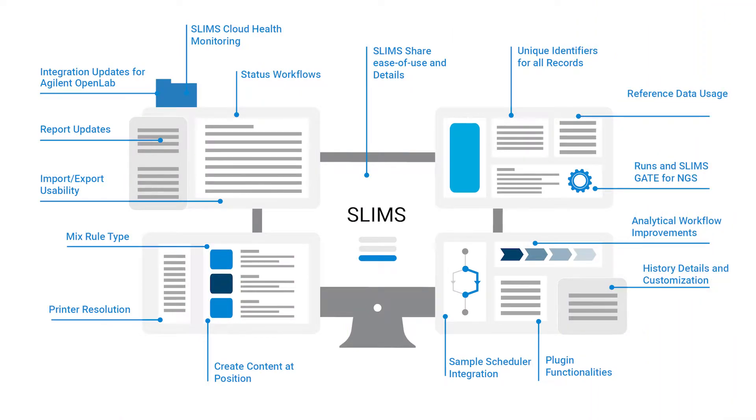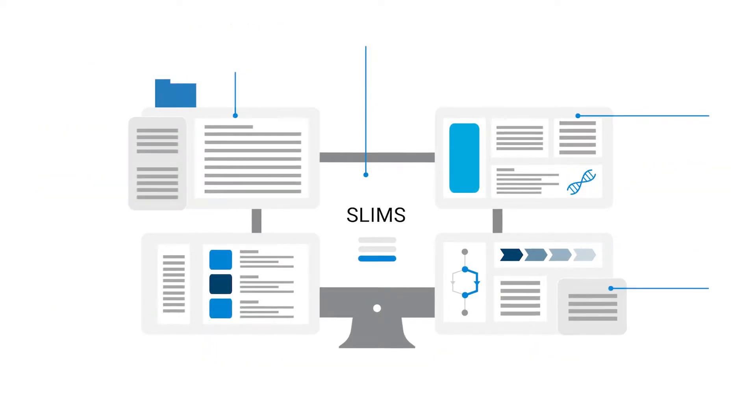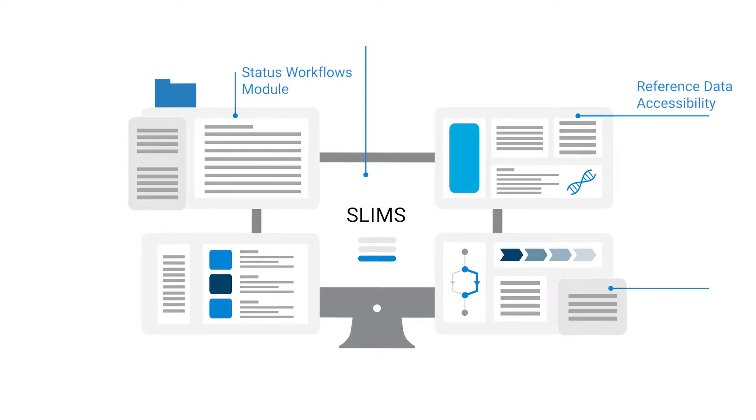Agilent Slim's version 6.6 includes a new module and quality of life improvements for Workflows, Configuration Sharing, History, and more. This Highlights video targets four of our most interesting upgrades: the Status Workflows module, Reference Data Accessibility, History Changes, and Updates to the Slims Share module.